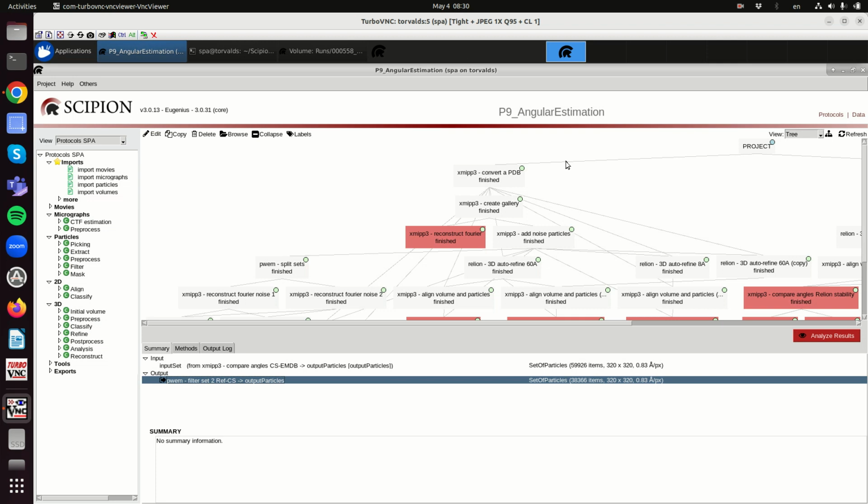Because the algorithms are not deterministic, you will have slightly different results every time, and you will have two kinds of errors, small ones and big ones.